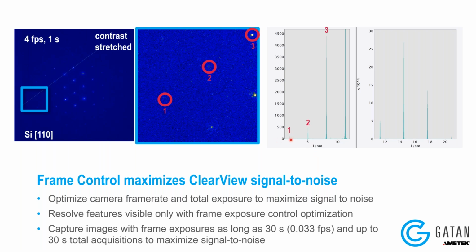And we can tell very well that there are these sharp peaks, although very faint, in the diffraction pattern here on the left. And then on the right is just the rest of the line plot plotted on a different scale. And so we can capture diffraction spots that have, call it, about 100 counts or so, like this spot number 1 that looks very, very faint in the pattern there. But we can also capture very intense spots with way more counts in them, on the right-hand side of the line plot, which correspond to these really bright spots in the images here.